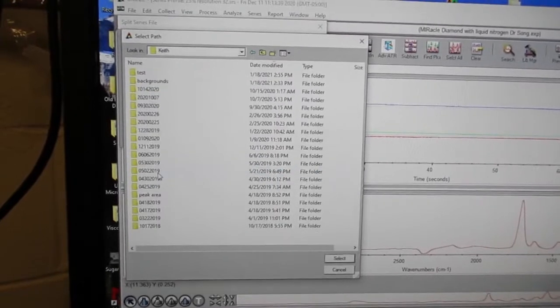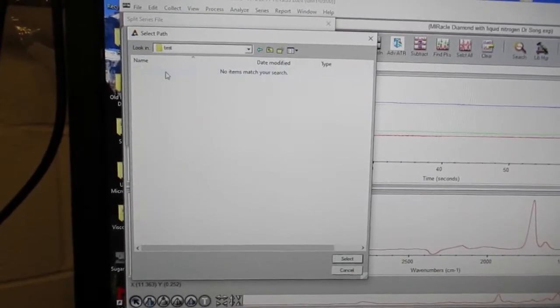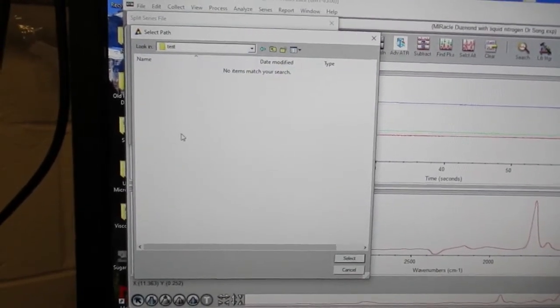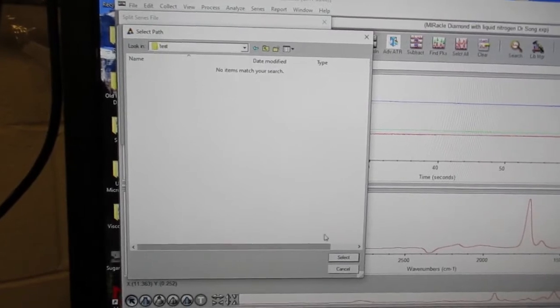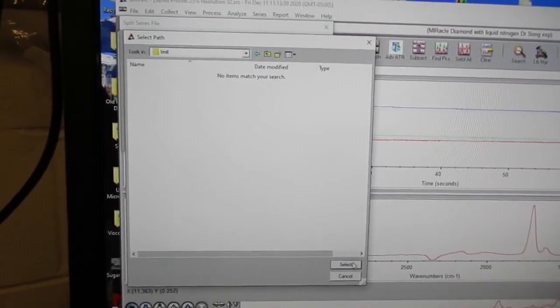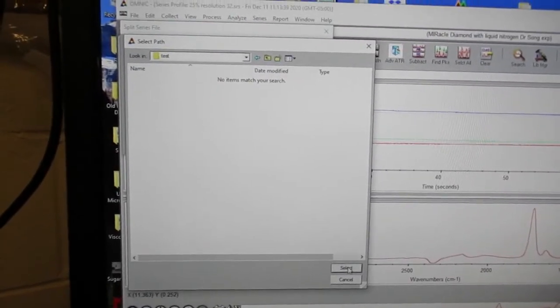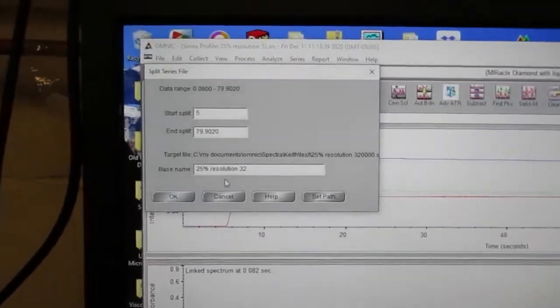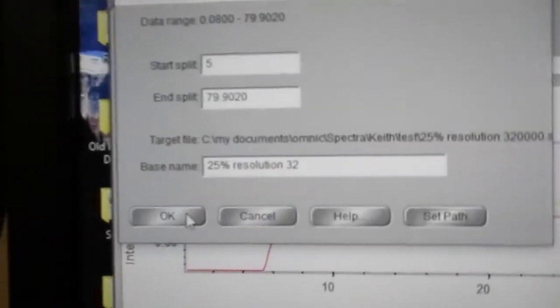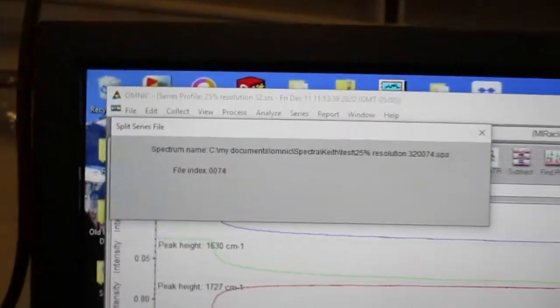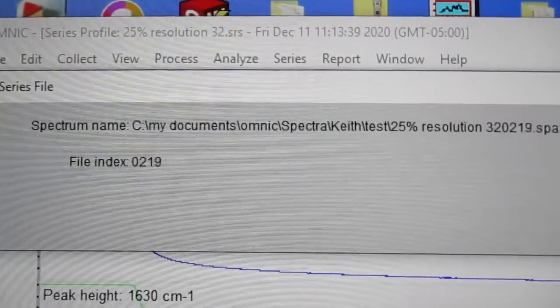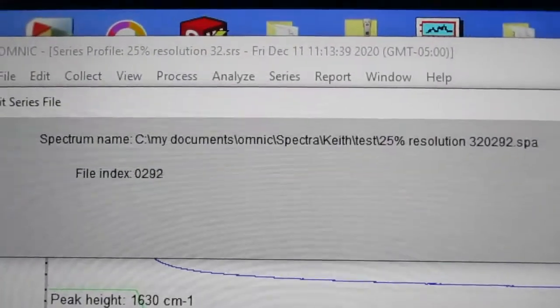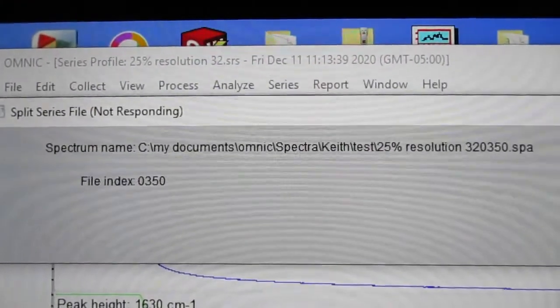You want to make sure you go to your folder and go into the folder that you used your sample with, then hit Select and then just hit OK. What it's now doing is literally listing every spectra that it took.